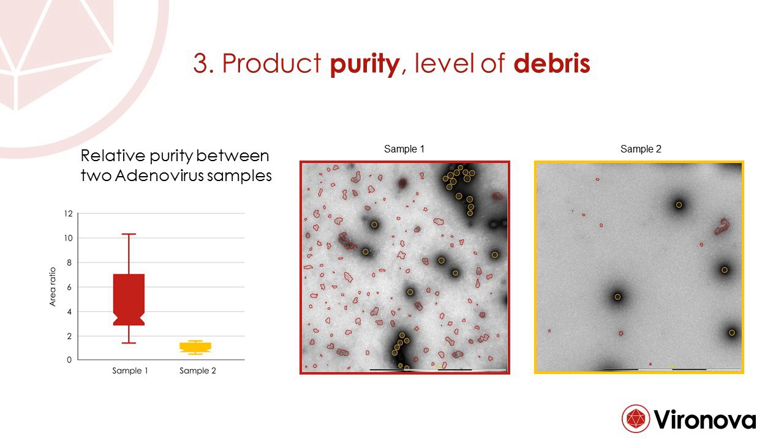You can see the distribution of relative purity between the two samples, and the images fit well with what we manually perceive as a clean or pure and not as pure sample. So in this way, we can get a quantitative measure of purity. You can start to rate and order your samples in terms of purity.